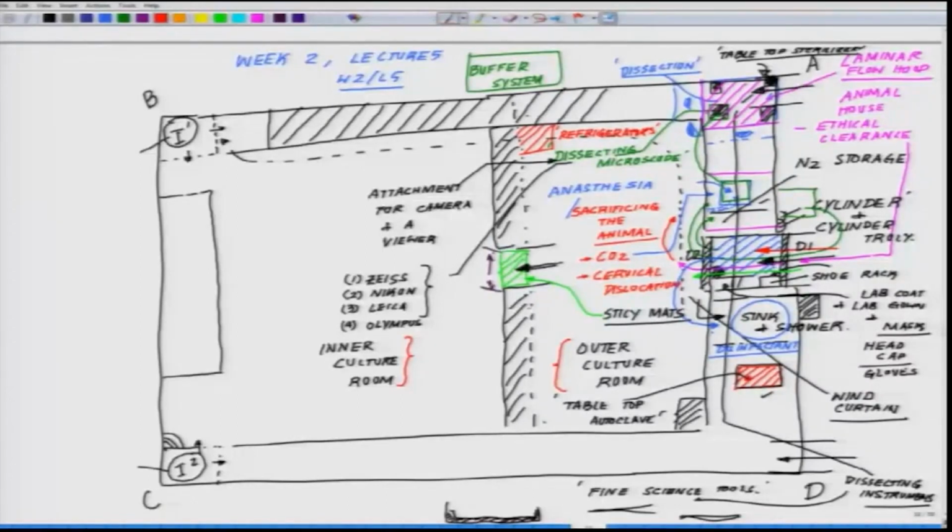And whenever you design that you want to place a refrigerator, you can have the countertop maybe cut at that point, and you can place the refrigerator in such a way that you are not consuming that space. So you'll have one refrigerator out here, depending on what is the strength of the lab. Now from here you move to the main frame out here.